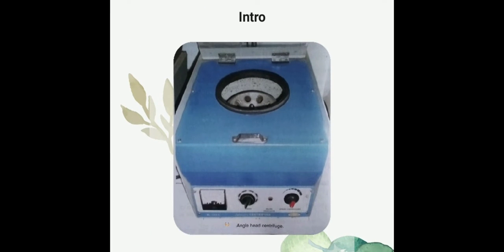The two general types of centrifuges used in the laboratories are the swing out head type, horizontal rotor, and the angle head type, fixed angle rotor. A rotor is a device used to hold centrifuge cups and tubes.